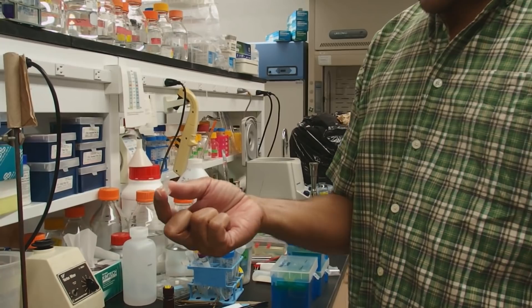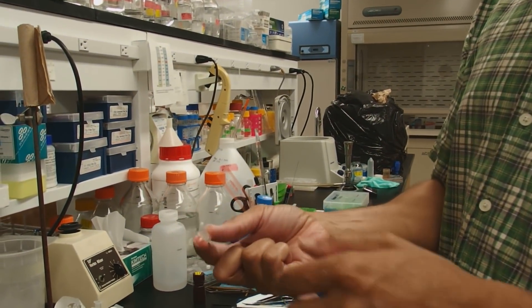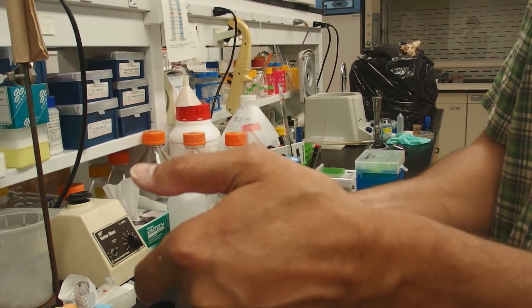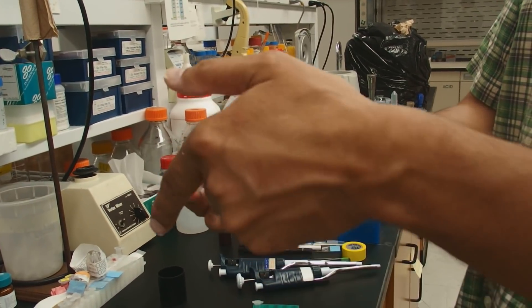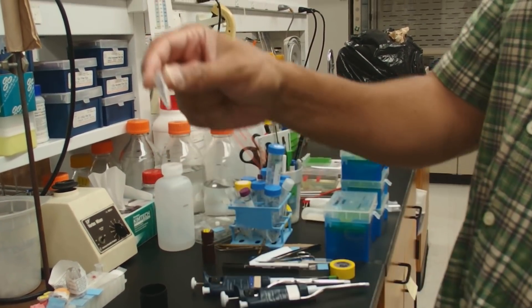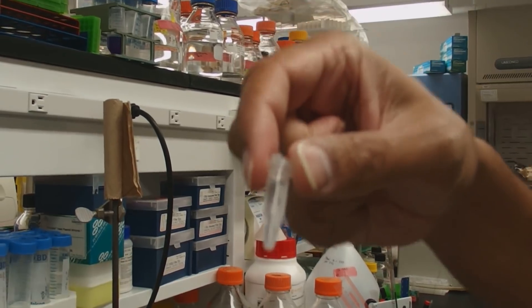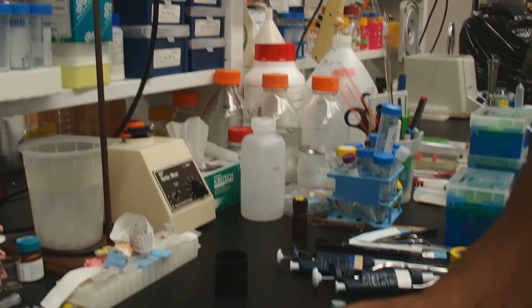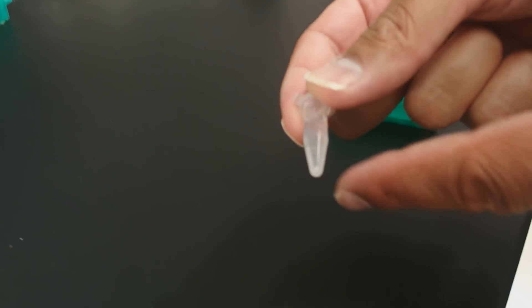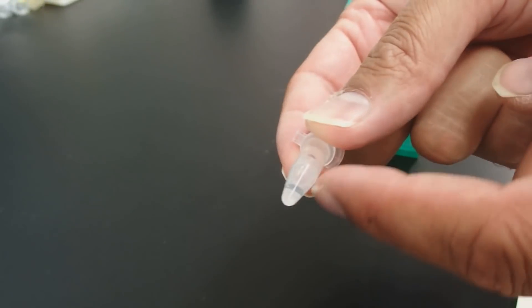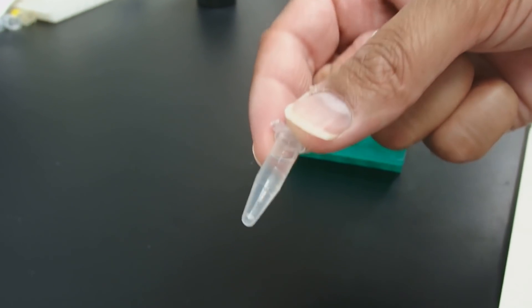Once we add 70% ethanol, the pellet becomes even more white. So we want to just mix this a few times. Like that. Now you can see this pellet. Let's put it against the black background maybe. You can see that the pellet has actually now dislodged from the wall. There. You can see that.